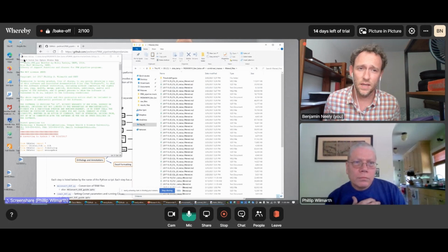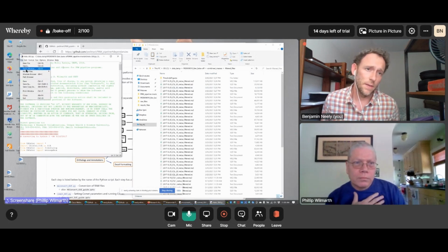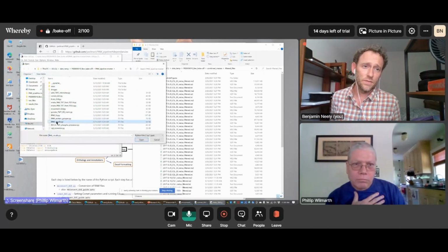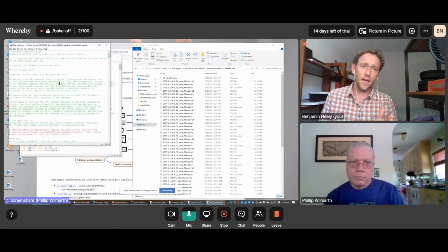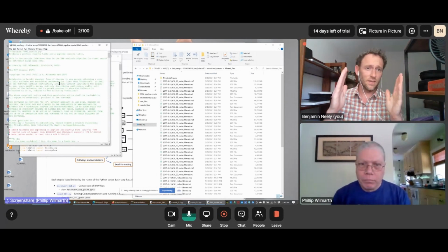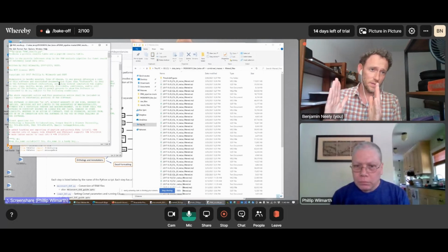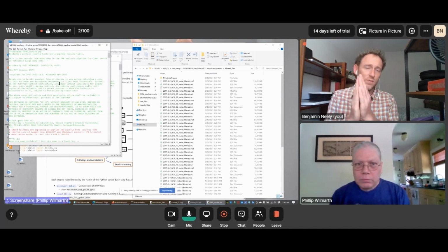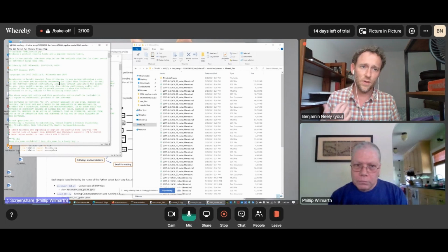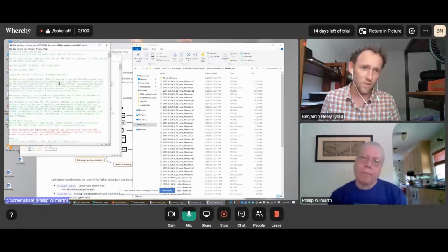And can I ask one, because I should have said it. If you're running this pipeline and you just don't feel comfortable playing around with certain settings, it's automatically going to set on those envelopes, it's going to kind of pick the shoulder of those peaks automatically. So that probably looks good. You can look at it, but honestly, it's probably good. And then those other thresholds are 1% FDR. They're probably fine too. So if you didn't feel comfortable messing with that, you could just click over and those defaults are acceptable. They're conservative.